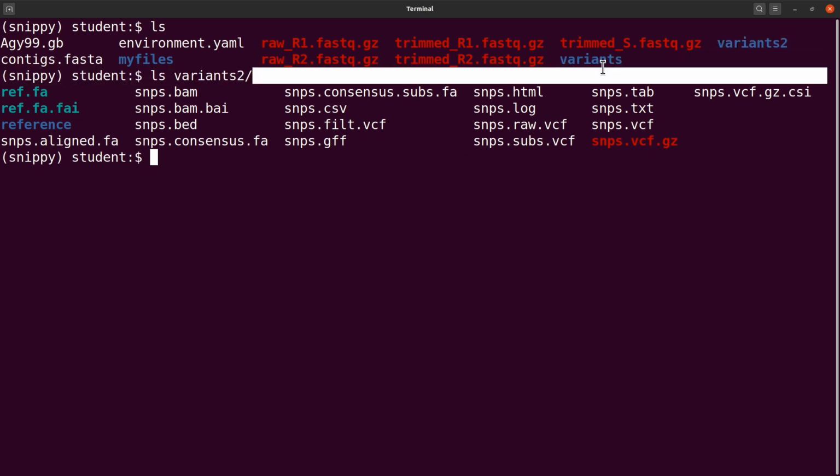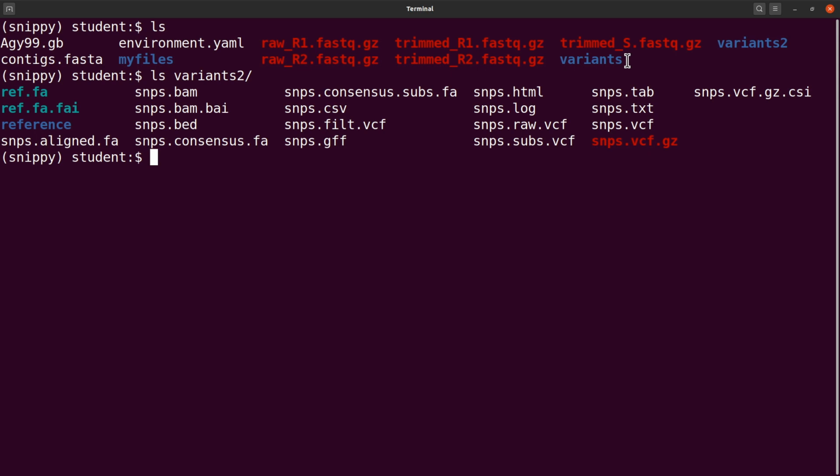This is where I also highlight that if you have scripts that are able to process these, then you don't even need to modify them much. Just a little modification to specify the files will give you the information you want instead of going back to clicking, dropping, adding, and whatever. This saves you a lot of time because you do less manual work.